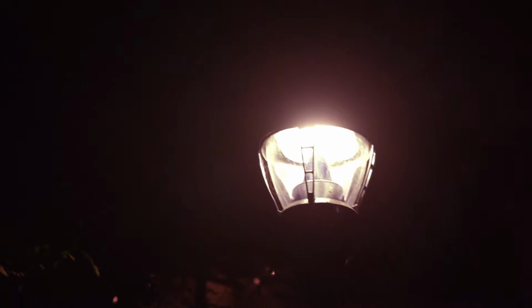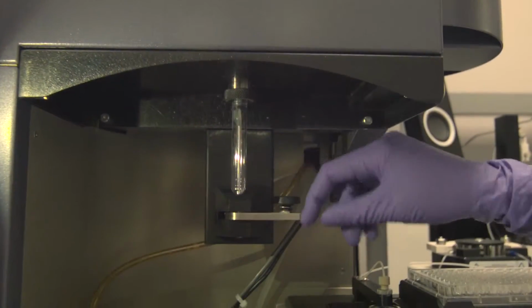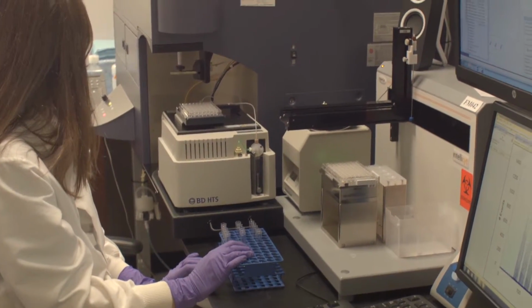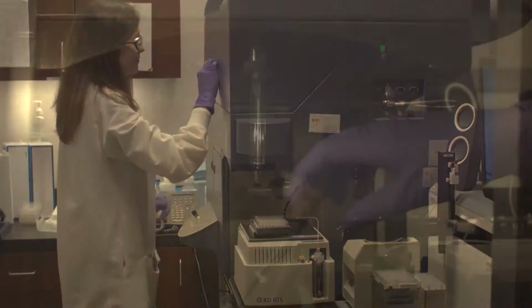You think of a lamppost in a park, and you imagine that lamppost is on at night. We can all imagine that that lamppost shines light in a very specific area. Flow cytometry does better than that. When you use flow cytometry as an analytical technique, you are looking beyond the light of the lamppost, and it allows you to take big facets of medically important data into decision-making in a simultaneous and real-time way. It is highly specific. It can measure millions of cells simultaneously, and it can allow you to look at multiple populations in the same sample.